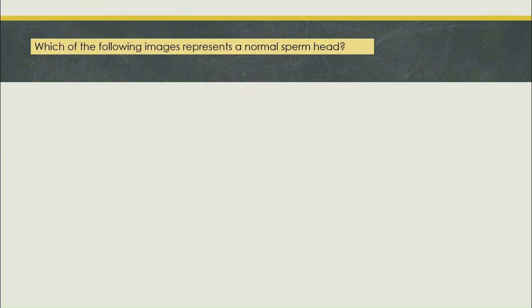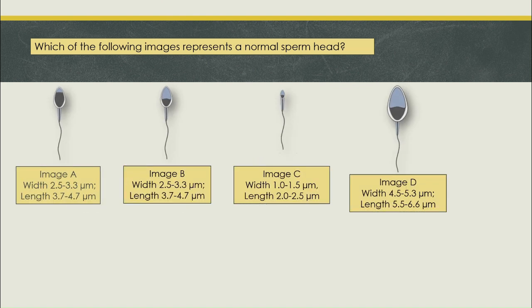Which of the following images represents a normal sperm head? Image A. Image B. Image C. Image D.